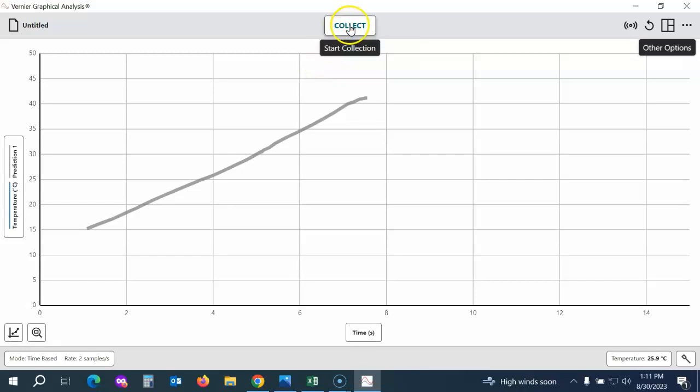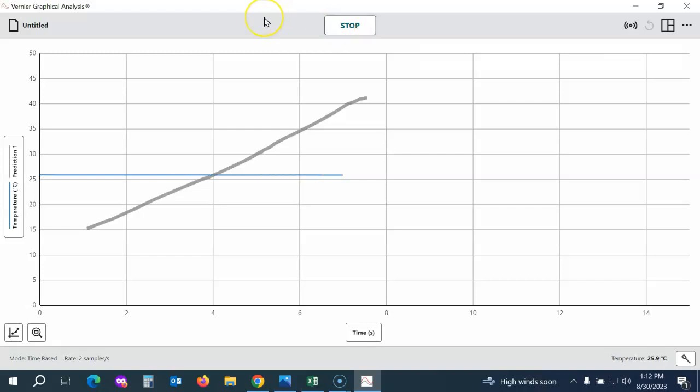Now I'm ready to collect data. I just click the Collect button in the top center of the screen and you'll see the line starts forming on the screen right away. If your students need to stop data collection early, they can click Stop, but it will automatically end at the end of the data collection time period that you set.